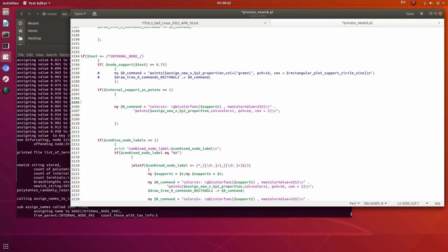So this R function has a color representative of a value between 0 and 1, and color being between two specified colors, and it is shaded accordingly.